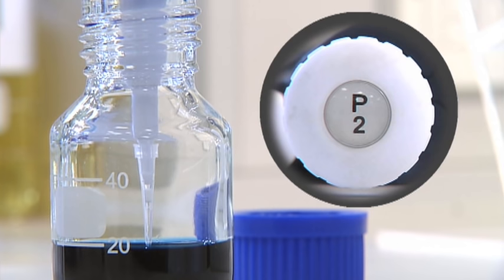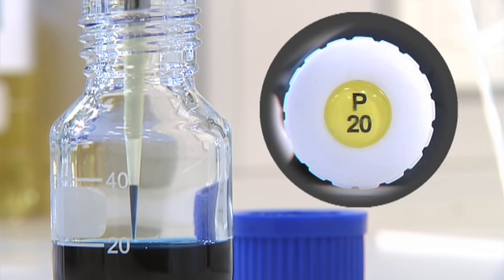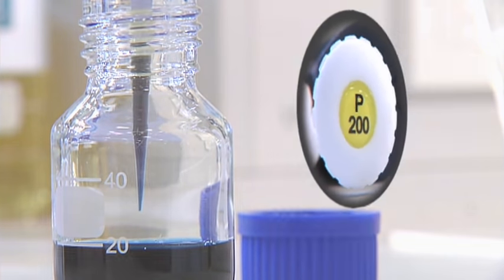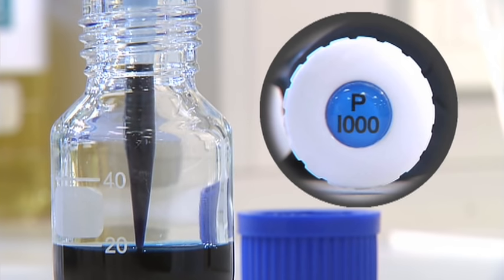A P2 pipettes between 0.2 and 2 microlitres. A P20 pipettes between 2 and 20 microlitres. A P200 pipettes between 20 and 200 microlitres. And a P1000 pipettes between 100 and 1,000 microlitres.